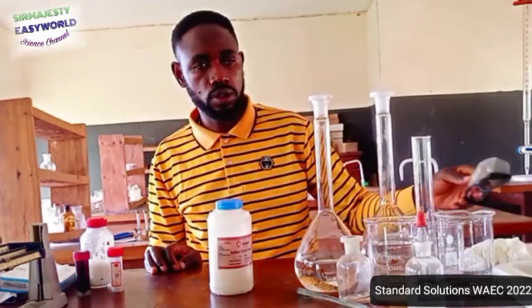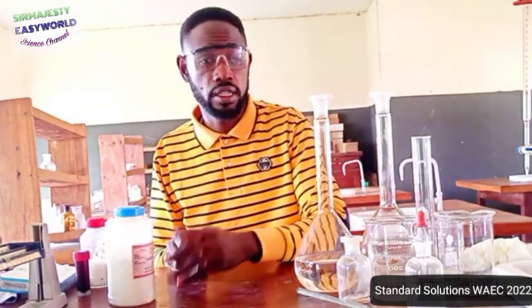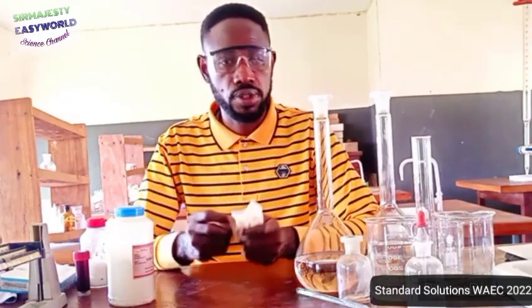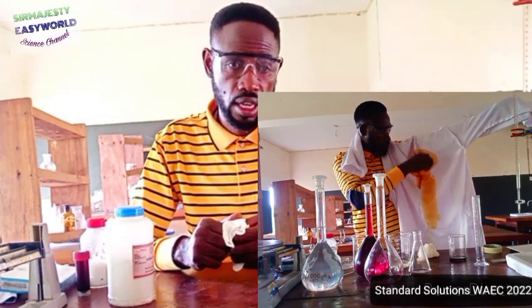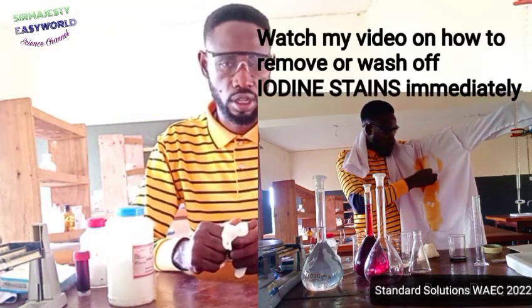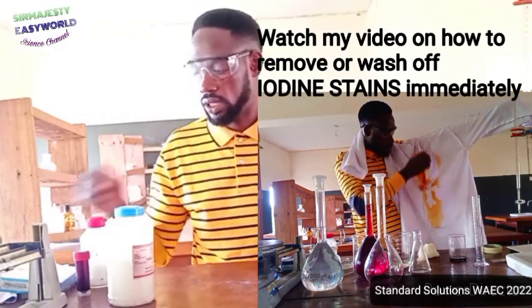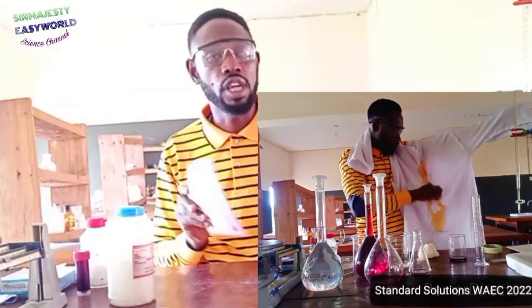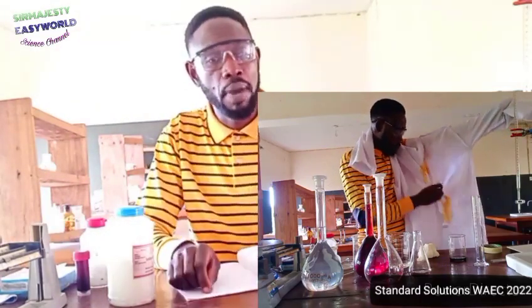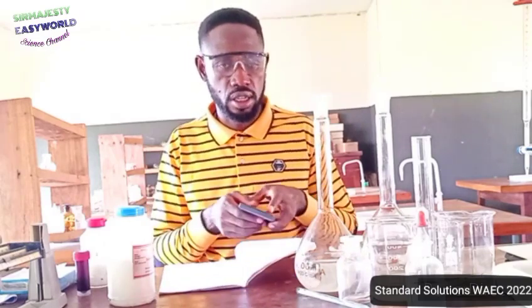Now, don't forget that you need your safety wears. First, you need your safety goggles. A good teacher should lead by example. Then you need your hand gloves to protect yourself, especially against iodine. It's volatile and it causes stubborn stains on any material it comes against. Then you also need your laboratory coats. Not forgetting, you need a calculator, and then you need a note. That is where you jot down the mass of your filter paper, the mass of whatever you want to use to measure, before measuring. Don't joke with all these things because accuracy is needed.